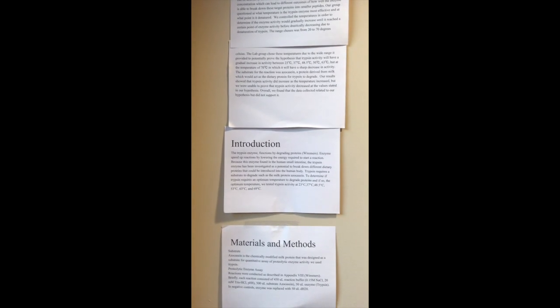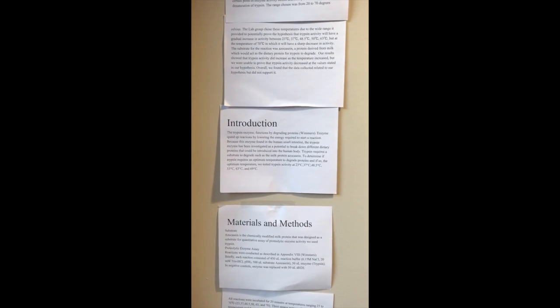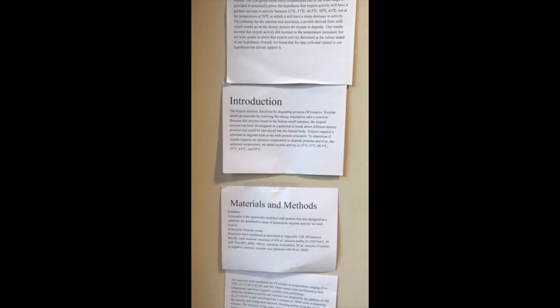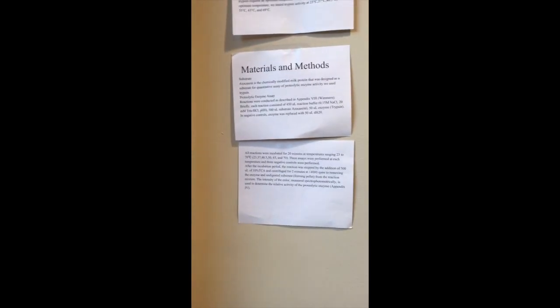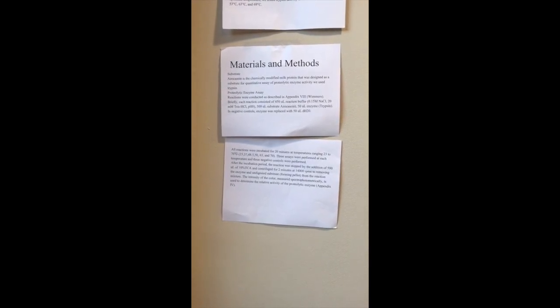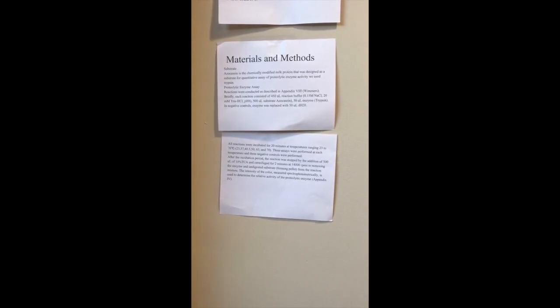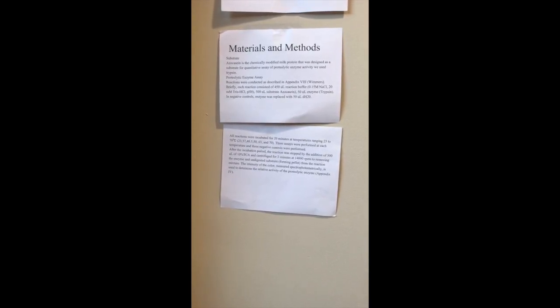Our group wanted to question whether trypsin activity would increase as temperature increased, and eventually get denatured as temperature increased to an extent. Our hypothesis: trypsin activity in azocasein will have a gradual increase between 23, 37, 48.5, 50, and 63 degrees Celsius, but at 70 degrees Celsius, the enzyme activity will have a sharp decrease due to denaturation. Our rationale was that temperature increases movement, so more movement meant more activity for the enzyme, and more peptide bonds broken by the enzyme.